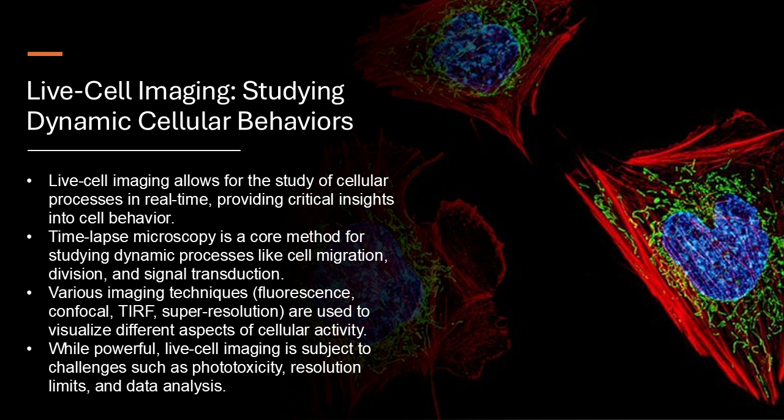It really is remarkable. And as imaging technology continues to improve, who knows what other wonders of the brain we'll be able to witness. Perhaps one day we'll be able to see those complex thought patterns you mentioned. That would be mind-blowing. But with all this incredible potential, are there any challenges or limitations we need to consider? It can't be easy to keep these tiny cells happy and healthy under a microscope, especially when we're trying to observe them over long periods.